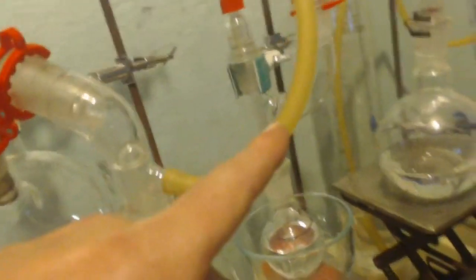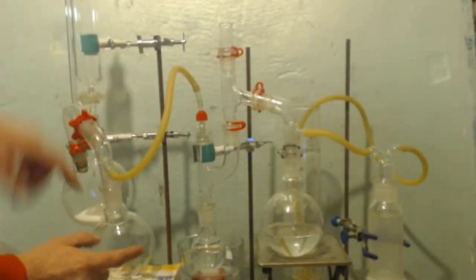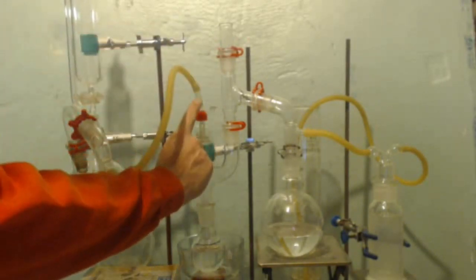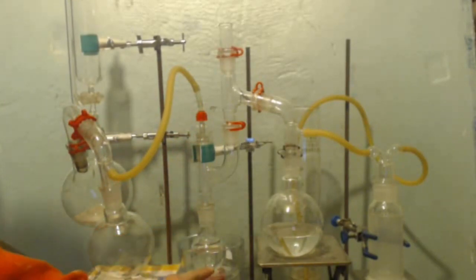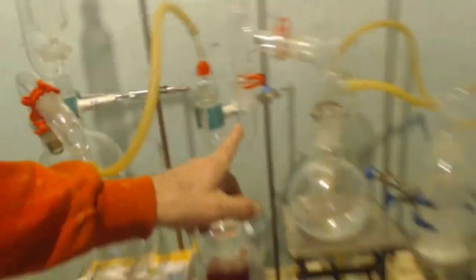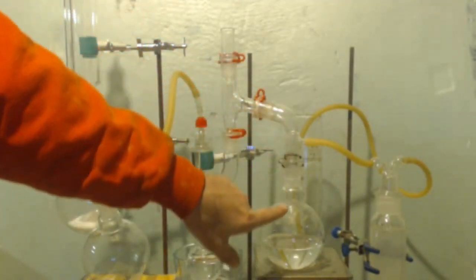And then the tubing goes out here, but look, this is just an open, you can think of this as part of the tube, you know what I mean? It comes up here, there's a tube in here. It goes all the way down to the bottom of this round bottom flask right here. Now, it bubbles through the water, right? And then it comes up through here, okay? Comes up here, around here, to here.